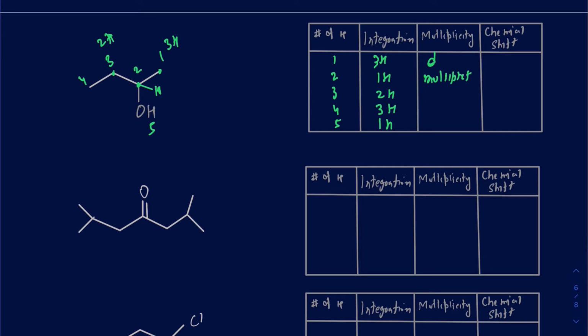And I also talk about chemical shifts here, which means where those protons are really going to show up. Rough ranges: methyl protons, if there's nothing close by, usually show up around 1 ppm. This second proton, on the second signal, is actually next to the oxygen atom. The oxygen atom being more negative, this second proton is going to be deshielded. So as a result, it's going to be somewhere around 3 to 4 ppm.